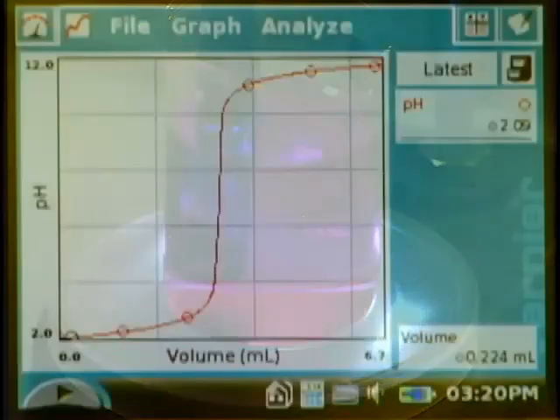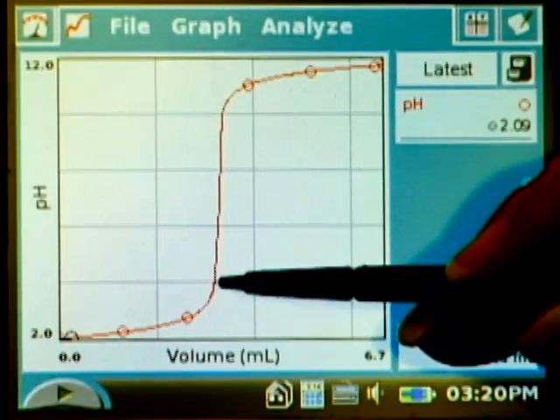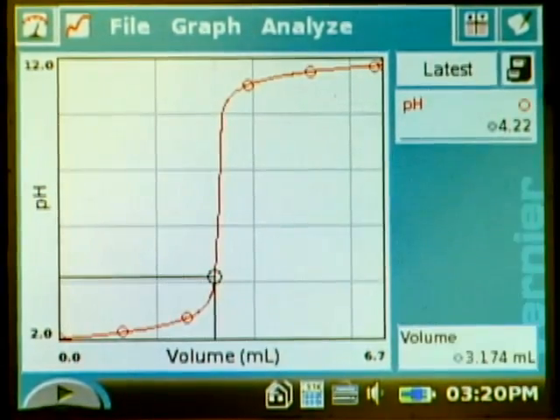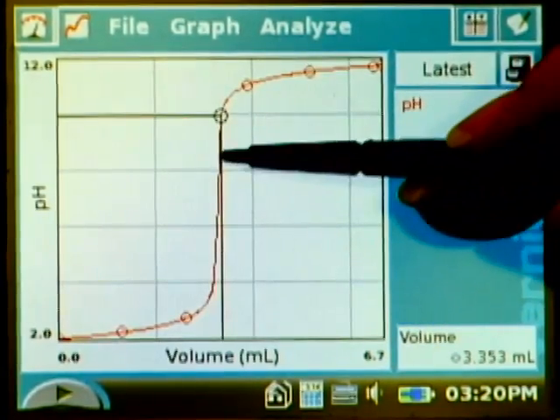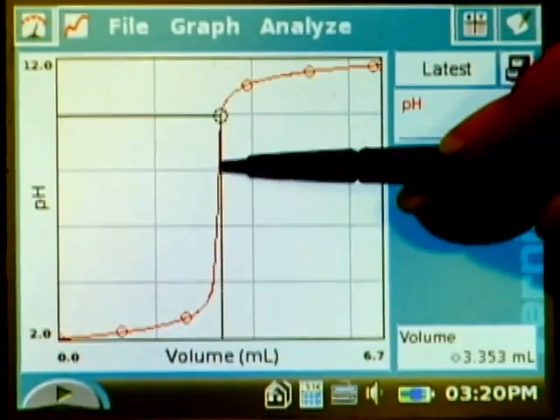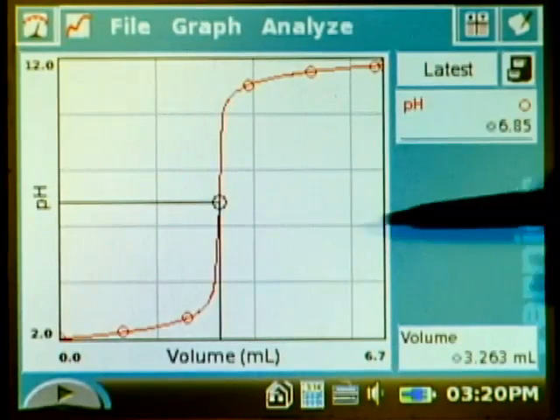Here's our finished data for our titration. When I tap somewhere on the graph it's going to give me the pH and volume for wherever I tapped on the data. We want to find the equivalence point and it's going to be somewhere in here but it's kind of hard to tell. So there are some better ways to tell than just by visually looking at the pH data.